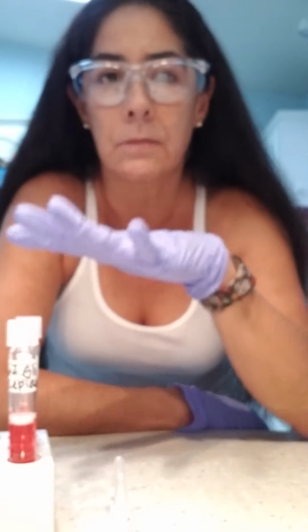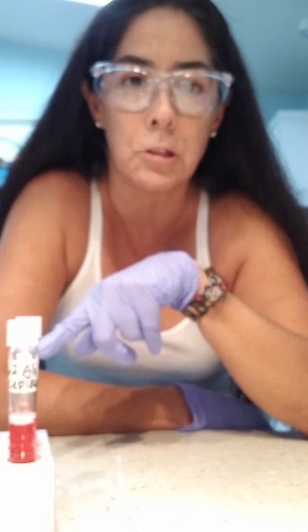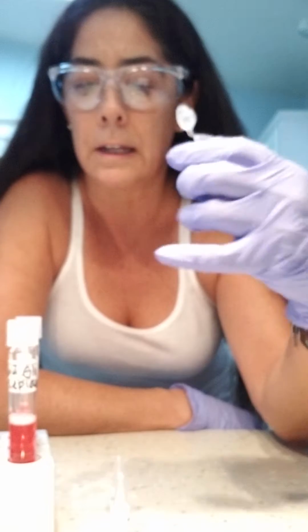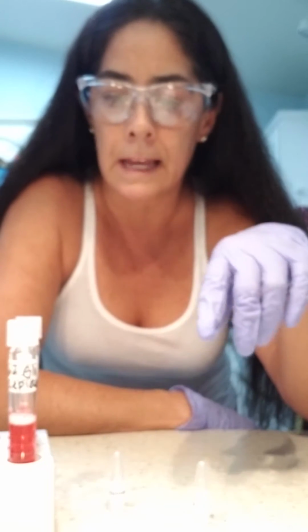So we have 6 vials here which I have labeled. 3 are labeled for the Cerevisiae and the other 3 for the epidermidis. I've already added the glucose because I struggled with it, so it was stuck to the bottom of my tube unfortunately, but we're putting half of the glucose in each one of these vials, meaning 2 of them, and then I'm putting fructose into the other 2, and then mannitol into the last 2. And I guess actually the one that I did use was the fructose.